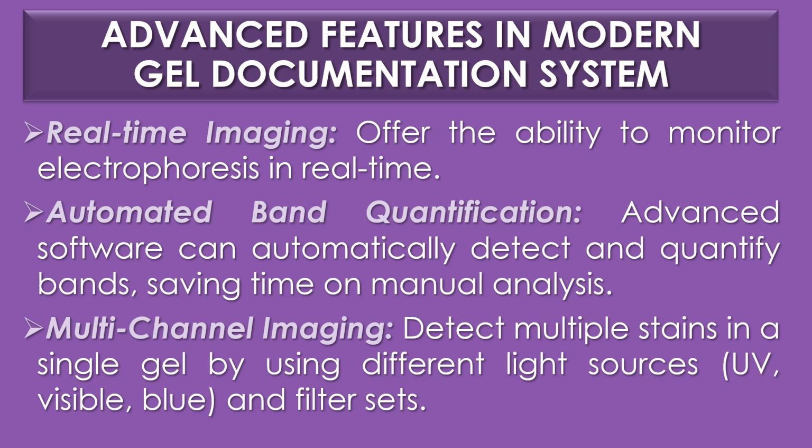The third advanced feature is multi-channel imaging. Some systems can detect multiple stains in a single gel by using different light sources like UV, visible or blue and filter sets.